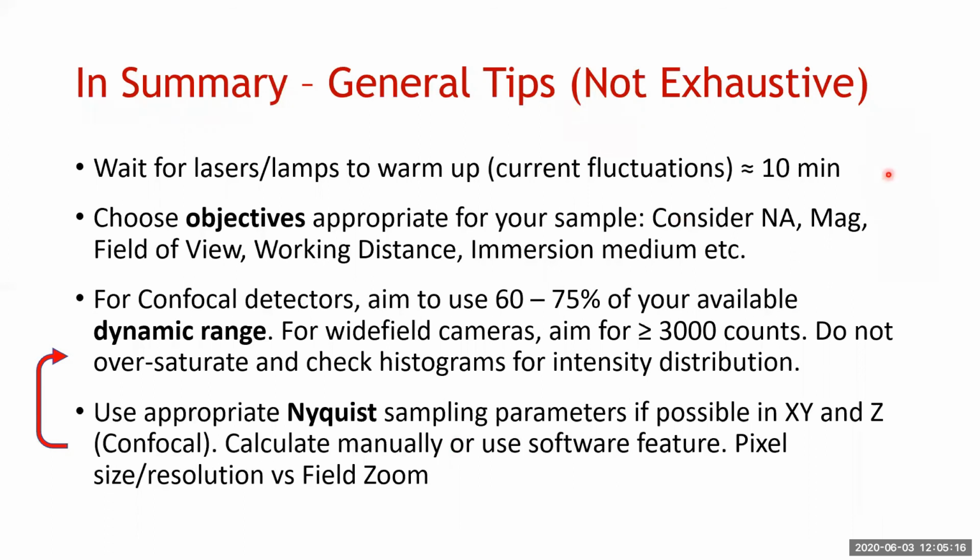So when you get onto the microscope, you want to at least wait a little bit before you get on and actually start using. Lamps, it makes sense. Lamps need to warm up. Lasers as well, you don't realize that they're not super stable when you turn them on completely cold, because there are current fluctuations. So they're pretty good nowadays, but there's no harm in waiting a bit.